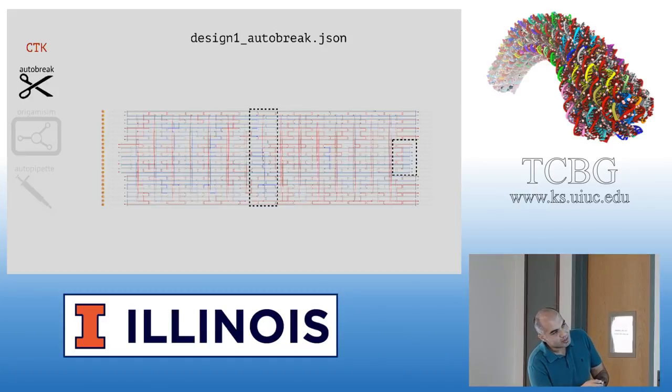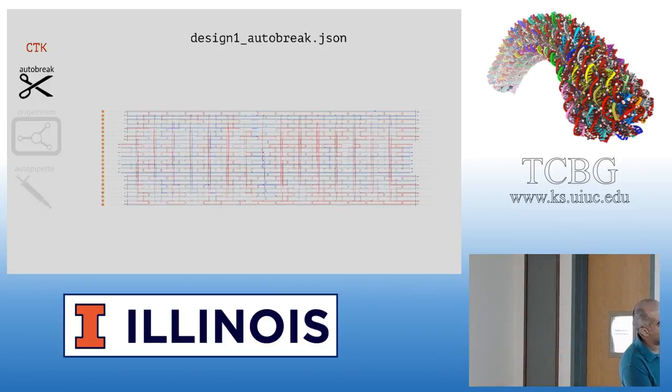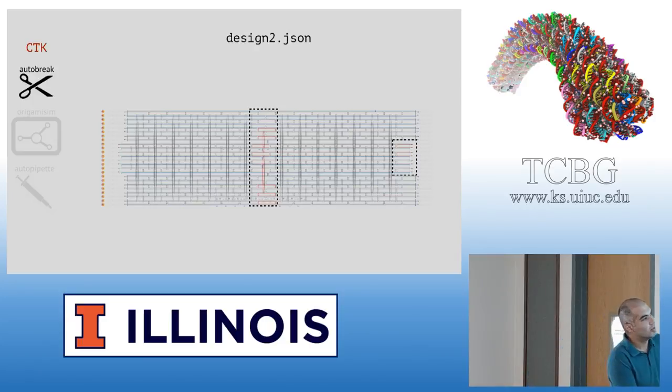And then you see there's one here where these oligos are kind of short, and because of that the TM value is lower. So what I sometimes do is go here, get rid of these crossovers, and make them a bit longer. Or here in this region, you will see that there are so many short fragments, like two-base fragments, that are not really good to have. So I sometimes change those, get rid of those two-base fragments, and make it continuous.